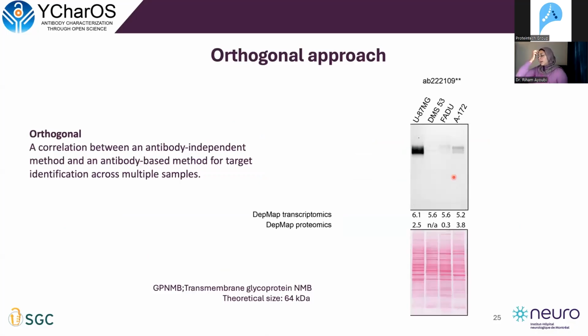I will clarify what orthogonal testing is. Orthogonal testing correlates results between an antibody-independent assay and signal from an antibody-based assay across multiple samples.